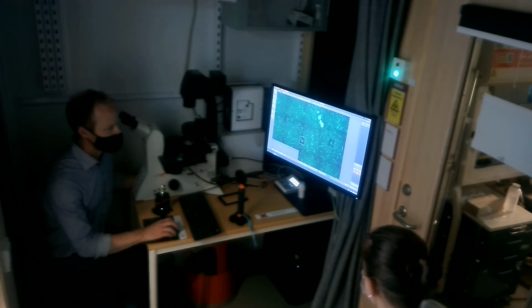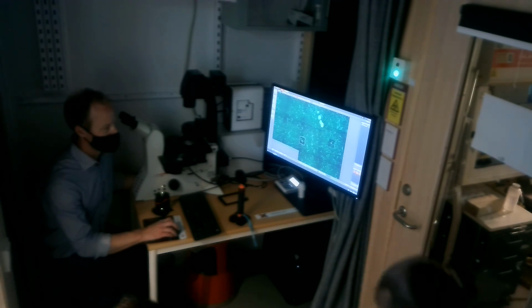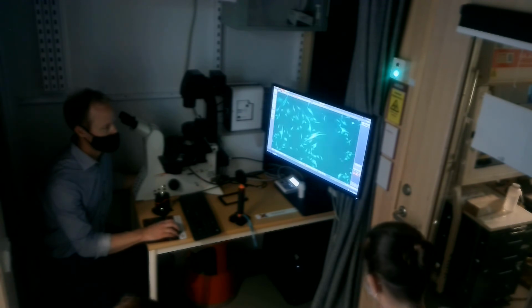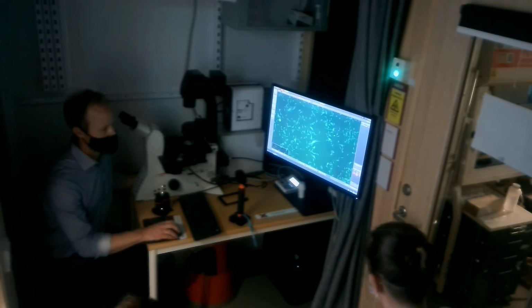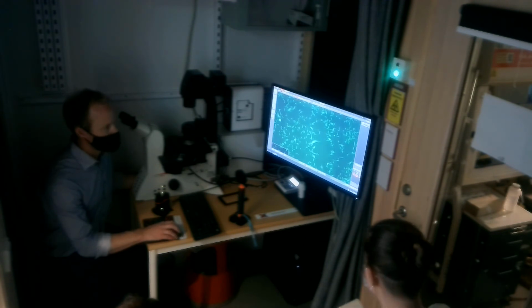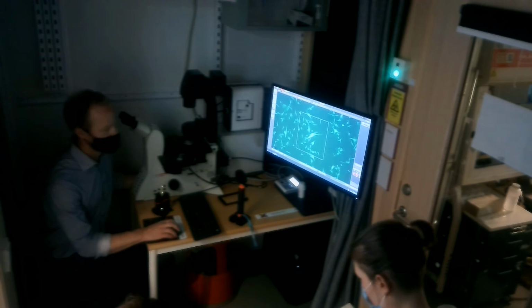Because there is also what you can do. You can also click on this one, single plane. So all of these tools here are different region of interest tools. So I can also click on single image, and I can add a single image. Like, okay, I want to capture this. So I see here that now we have one more image there. I might want to take this. But these positions, they don't have a Z position attached to them.